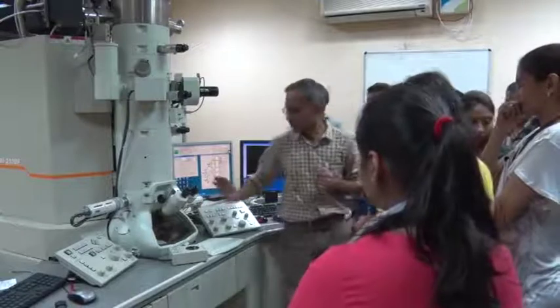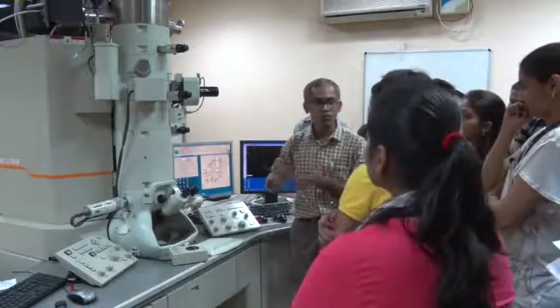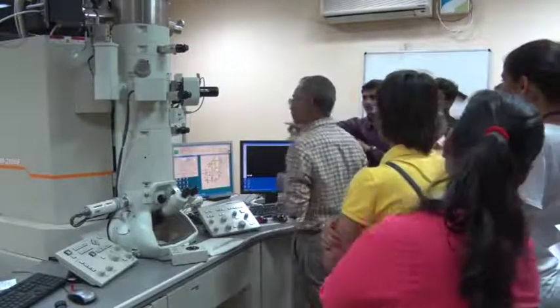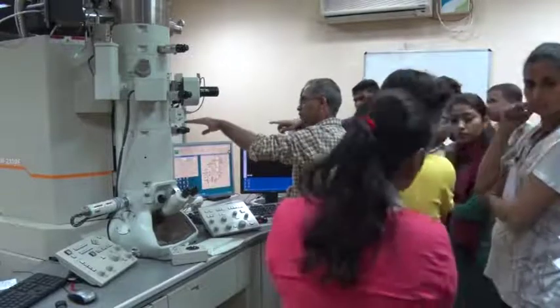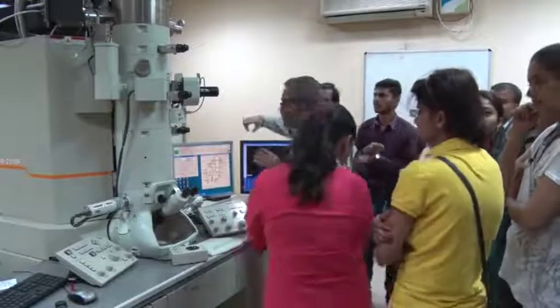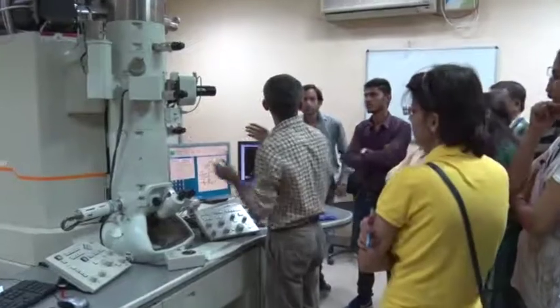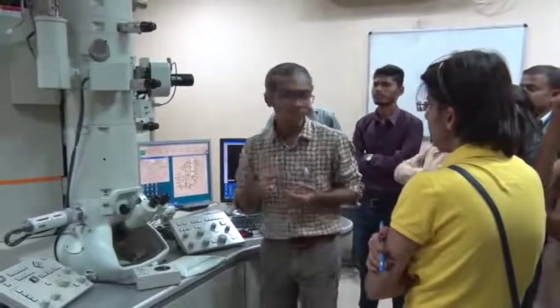Okay, so I think this is more or less explained. Up to here we can use in diffraction mode from that aperture. Which one? This one. This is not the diffraction aperture. This is called selected area aperture. So that's what we were trying to explain.